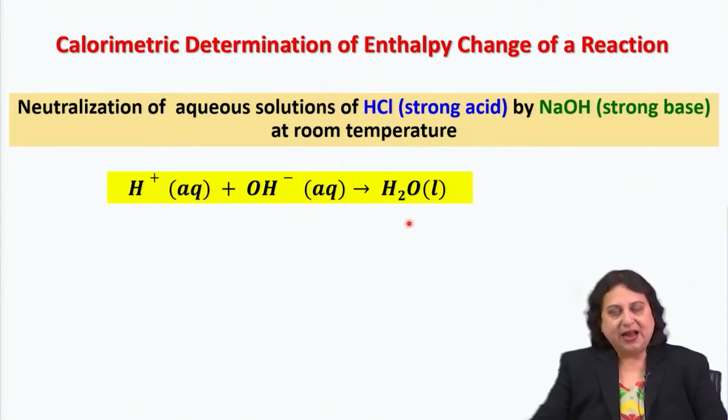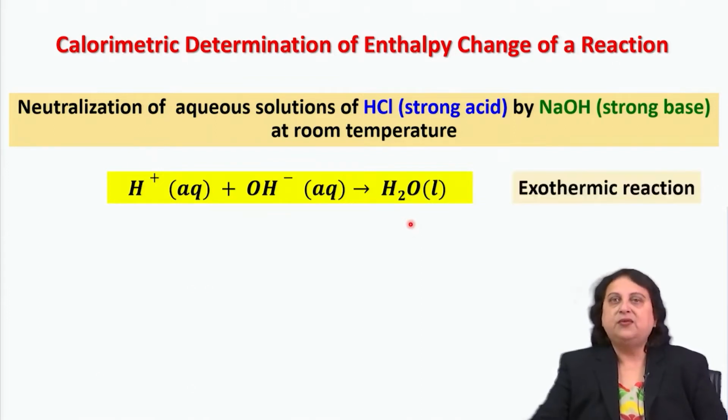And in the reaction that I have with me today, that is HCl and sodium hydroxide, this is a well known exothermic reaction. So, I understand that if I add sodium hydroxide solution to HCl solution, there will be heat evolved, and I am going to find out how much heat has evolved as a result of complete neutralization of the given acid solution.